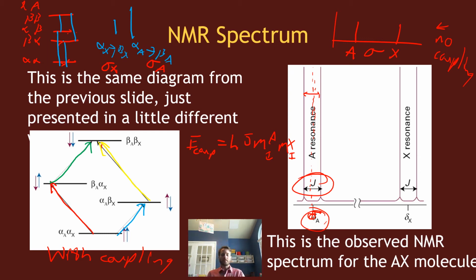But here, just focusing on studying chemical shifts, if I measure the energy gaps induced by an external magnetic field on my nucleus, I can get unique information based off of the local environment related to the chemical shifts, as well as how strongly different nuclei are coupling together to induce a splitting in the peak. And this nuclear coupling is going to have a distance dependence.